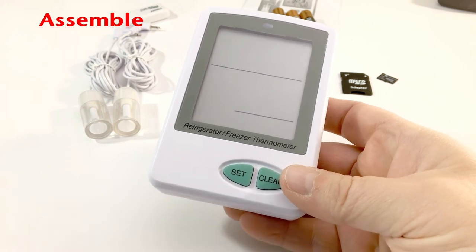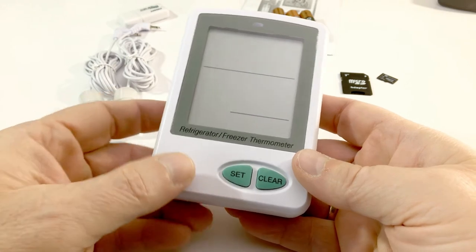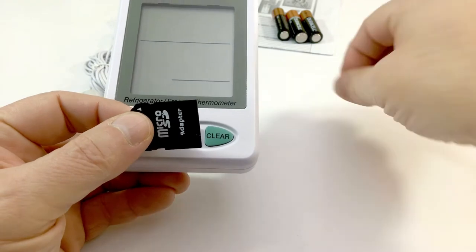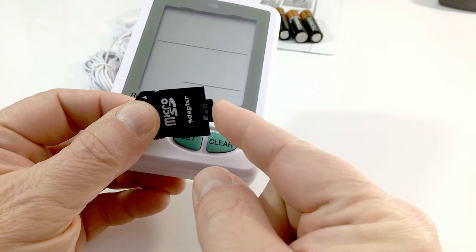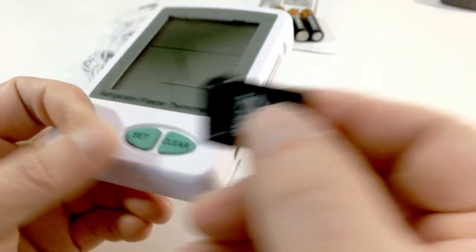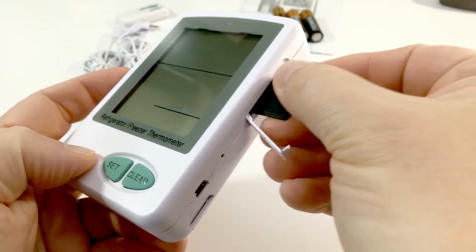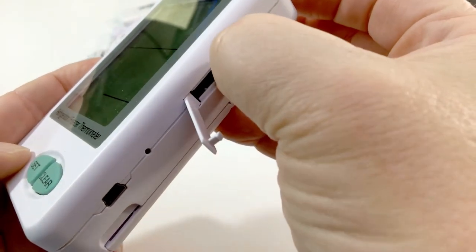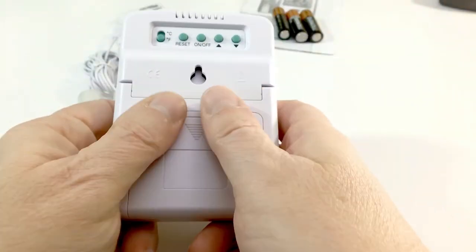Let's assemble the unit with all the components and get ready to configure. Take your SD to micro SD card adapter, insert your two-gigabyte SD card into the bottom of the adapter. Open the slot for the SD card on the unit, turn the contacts facing upward, place it in the slot and press until you hear a click. Shut the door and install the batteries.